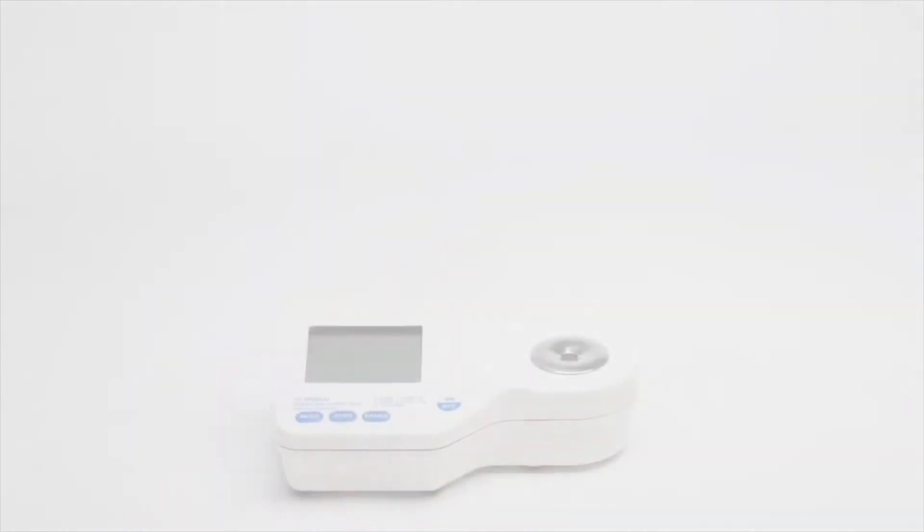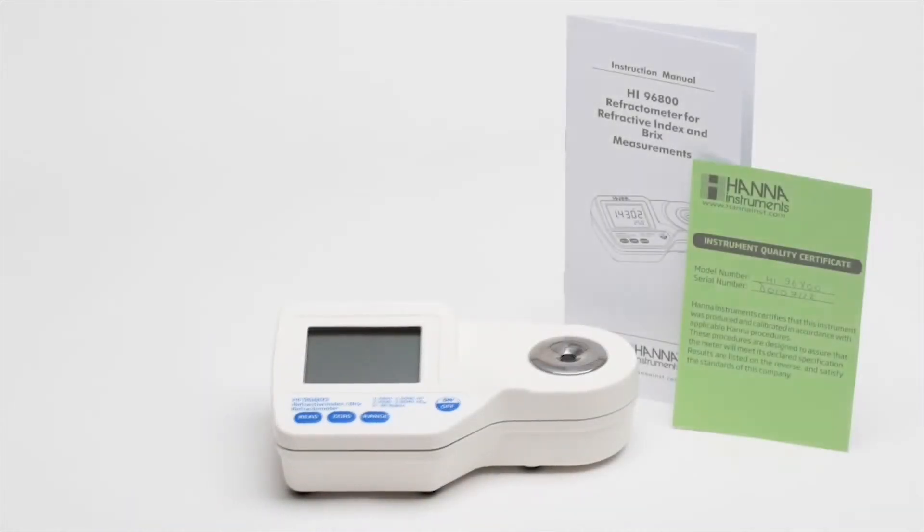Each new refractometer is supplied with an instruction manual, testing certificate, and 9-volt battery so the user can start taking measurements right out of the box.